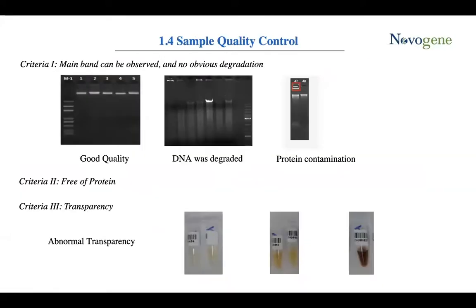After DNA extraction, we move to sample quality control. For sample QC, we have mainly 3 criteria. For the first one, we look at the picture on the left here, in which the main band is tight and can be clearly observed, and there is no obvious degradation.